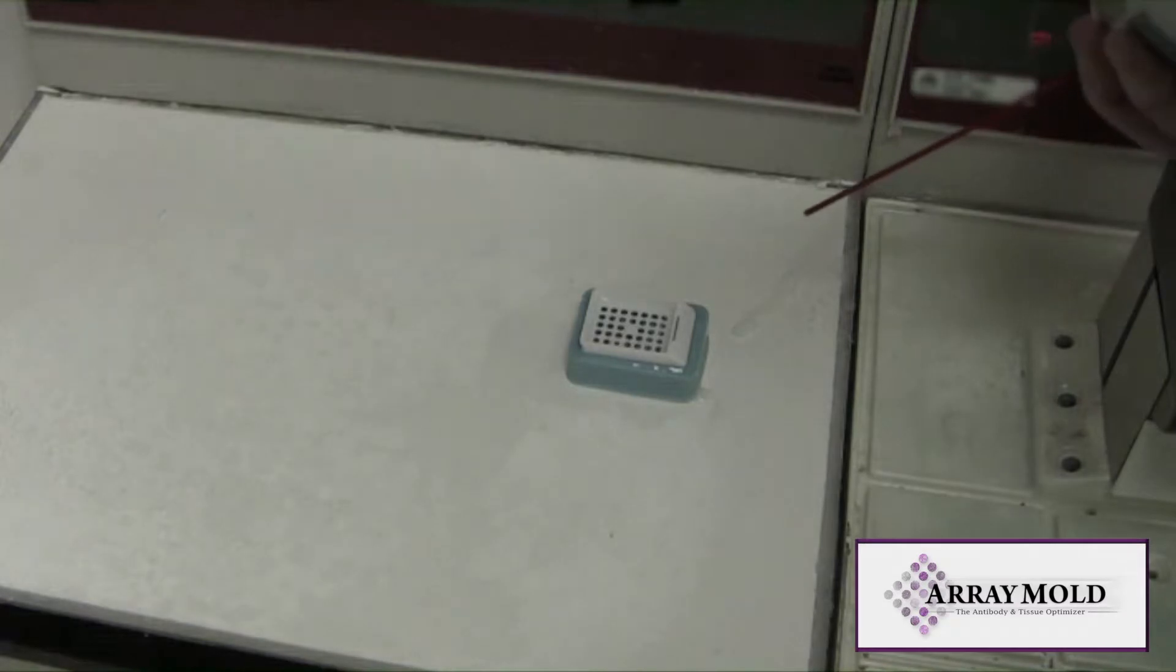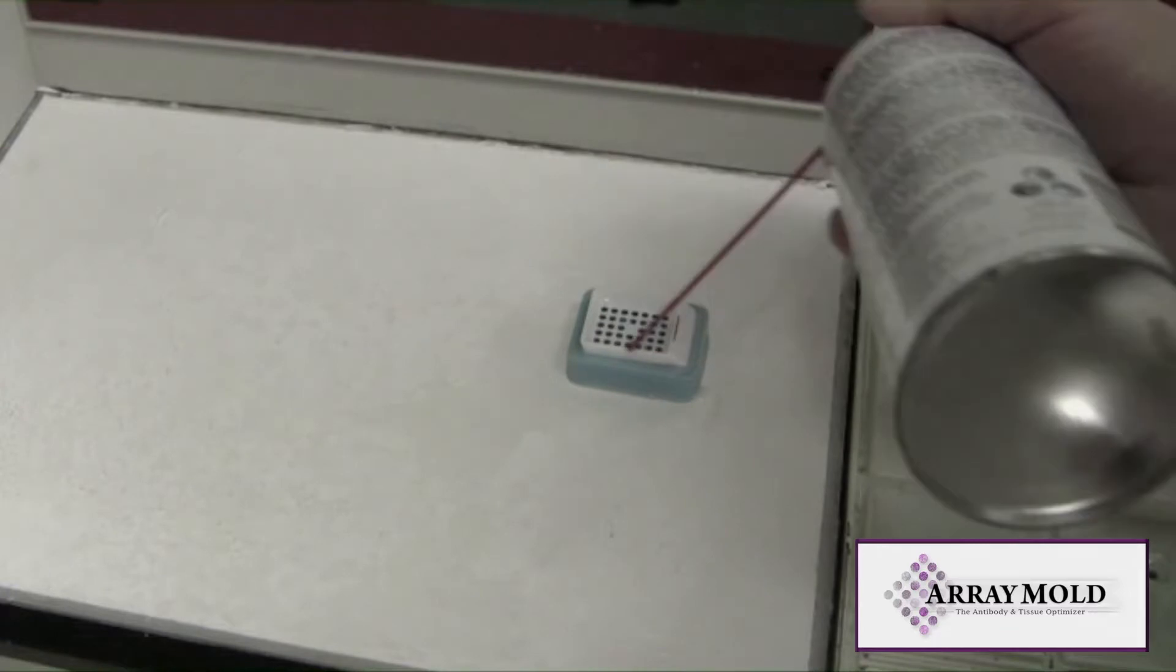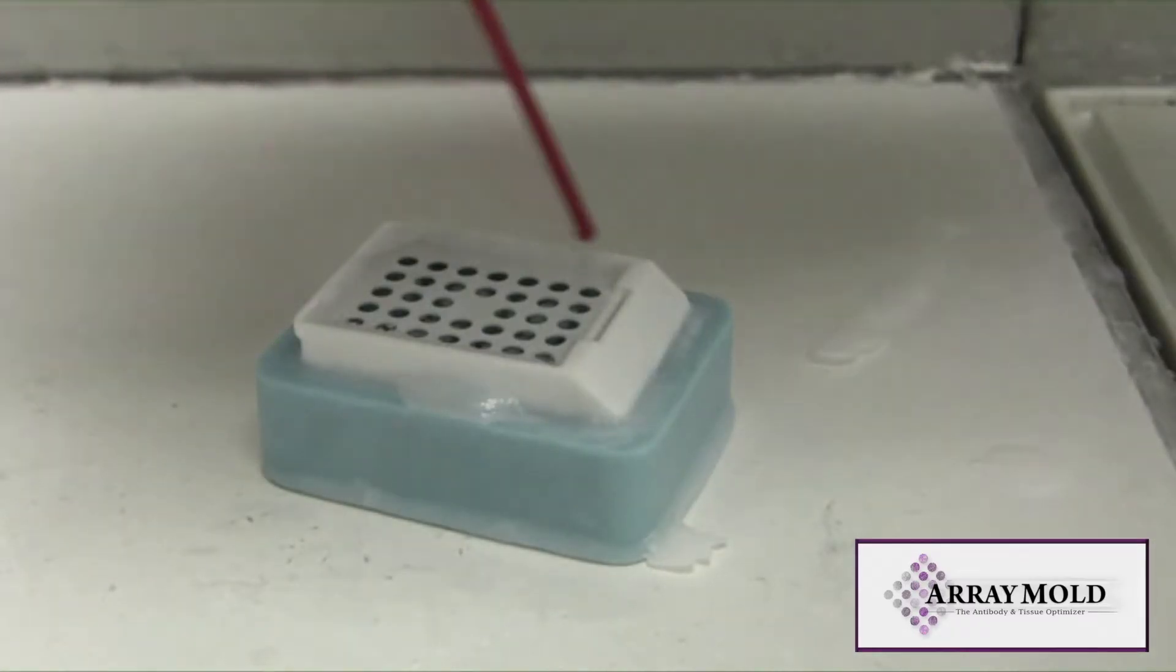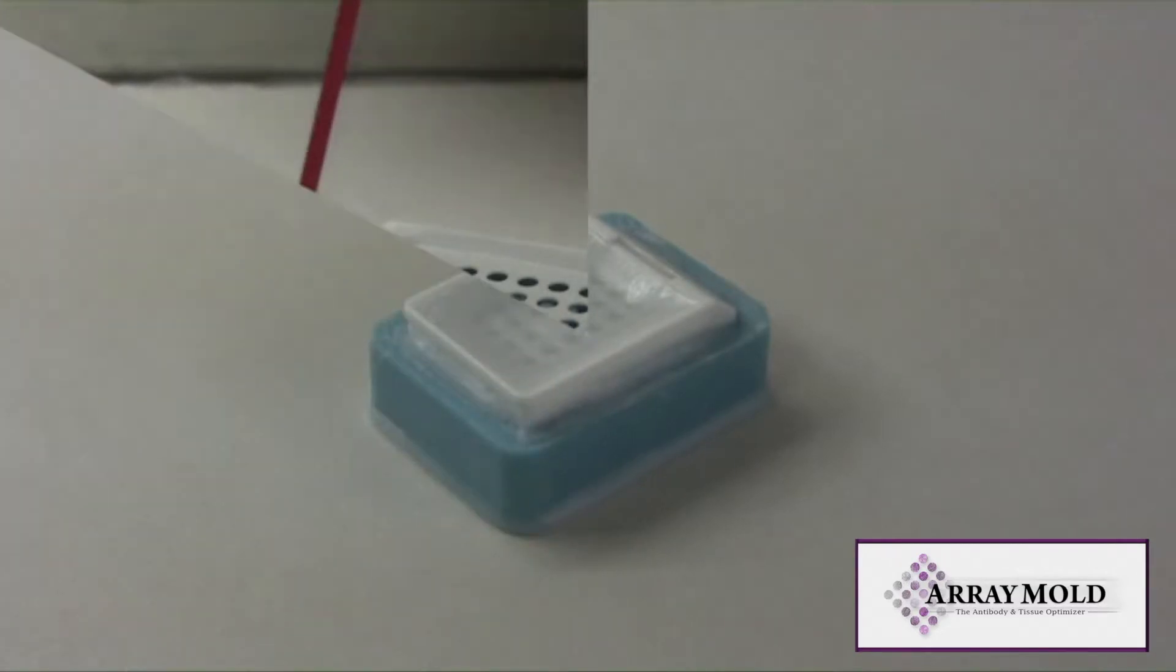I'm using freeze spray here around the cassette. This creates a paraffin seal so that the paraffin doesn't drip out because you need to fill the cassette to the top and this will give you a good solid block for making your tissue microarray.